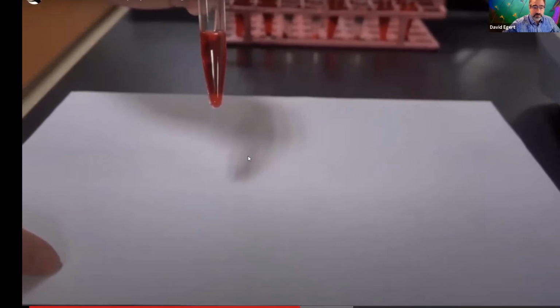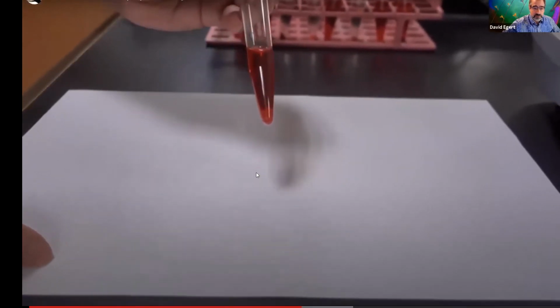So I'm going to go through this. I also have pictures of all of these tubes as well that you can look at afterwards. I'll continue with this, but know that you can go back and look at this. And also I have pictures that I put onto the module that show the tubes that you can look at. Tube 0, this is the most hypotonic you can get.